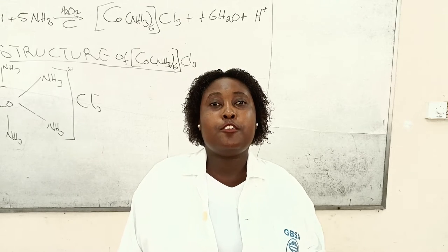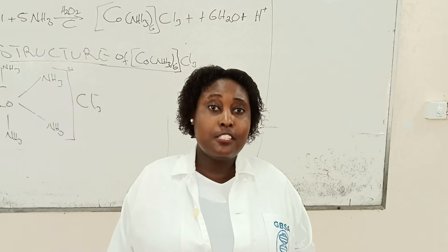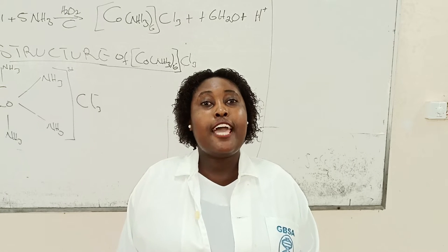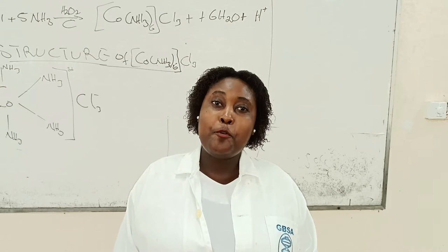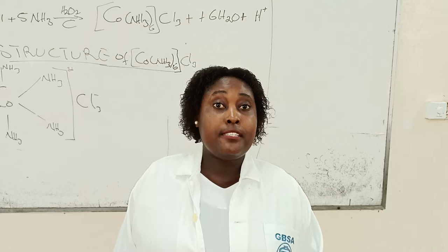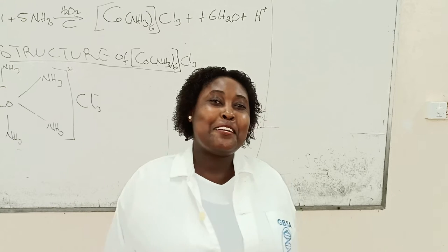Today's video is on synthesis. In my last two videos, we did practicals on synthesis, and today too is on synthesis. Today we are going to synthesize hexaammine cobalt 3 chloride. I have to take my time and pronounce it so that I don't make any mistake for my students to laugh at me.